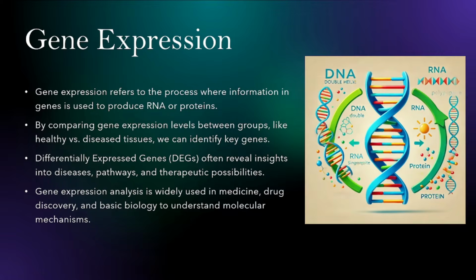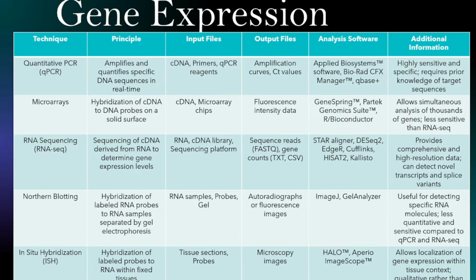Okay, so many applications are there for gene expression analysis. These are widely used in medicine, drug discovery, and biology to understand the molecular mechanisms. And today we are going to take a hands-on approach to explore and study gene expression analysis by using various tools.